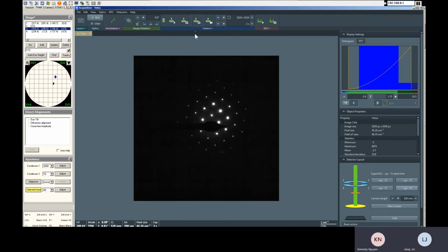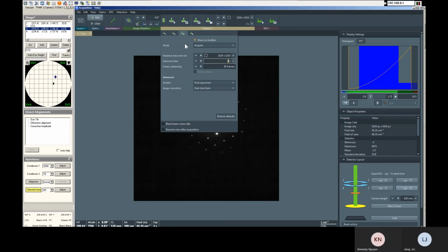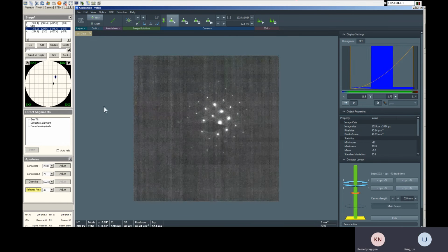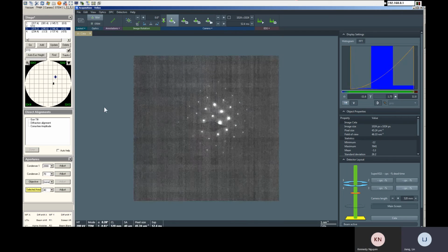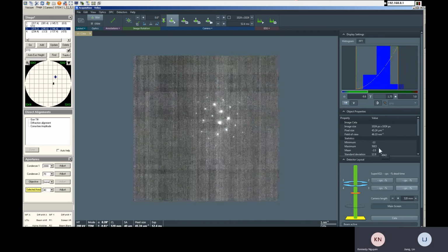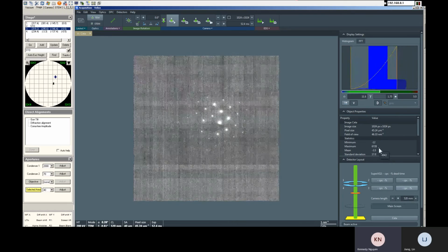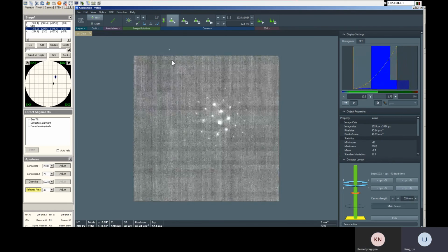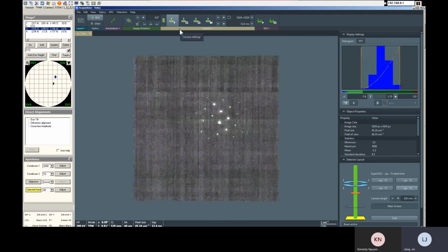Let's preview again. Let's check. 1 second, 1 frame. Let me leave the screen. Let's bring down the intensity. It's a little high. Let's bring down the intensity further.